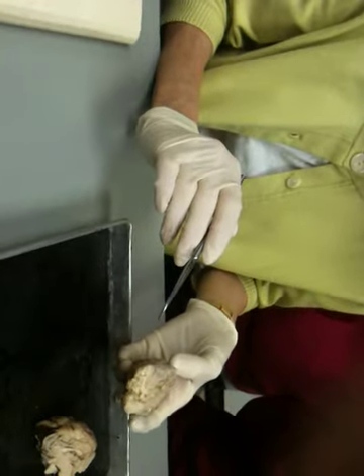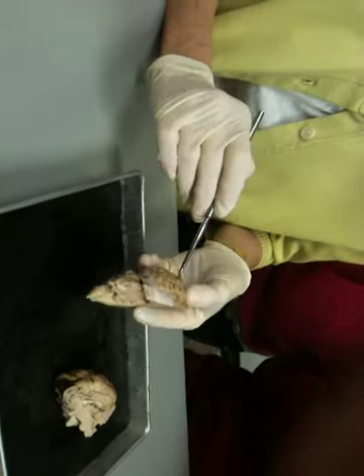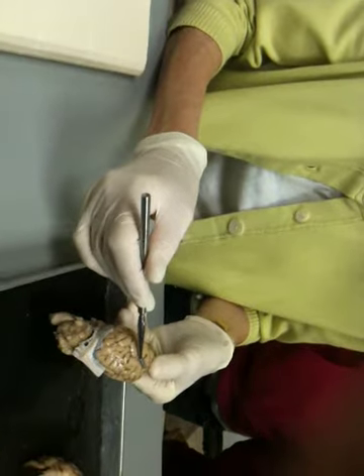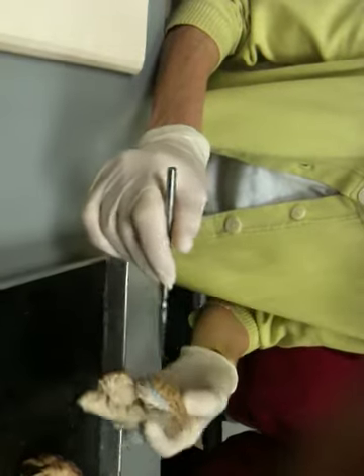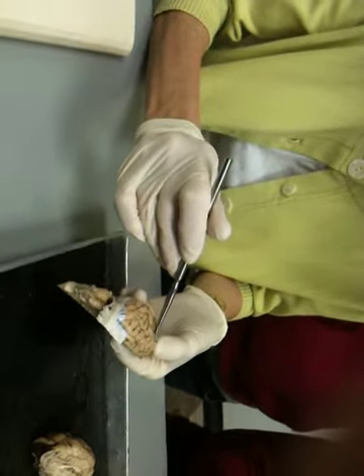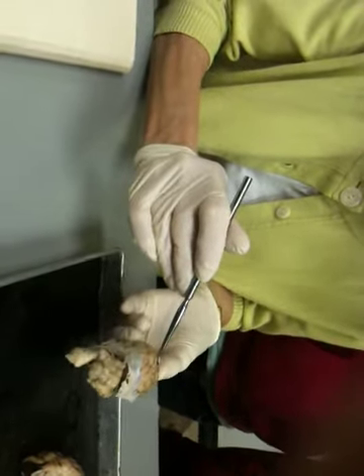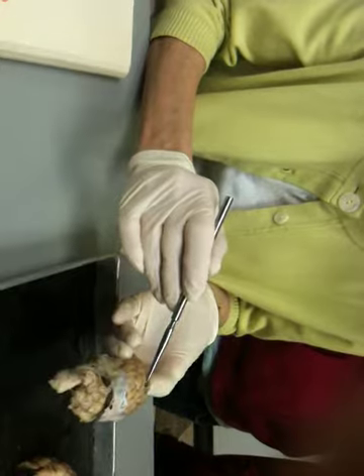Okay. You guys have any other questions? And you're not going to ask us about the different layers of the meninges? No, sometimes you can see the arachnoid. You can see the arachnoid here. It's this shiny stuff. And the dura is the thick white. Maybe extra credit. It's the arachnoid. It's on your list for the sheep brain. You have to probe it to see it. It's kind of hard to see. It's hard to point out because it's clear. You can always put your retractor in it.